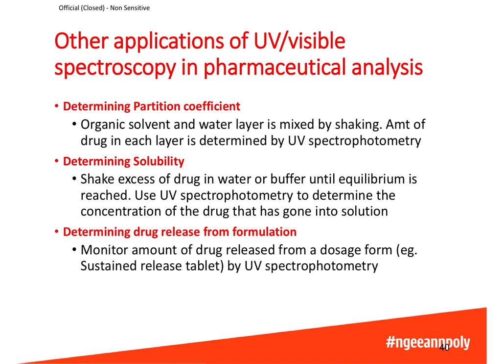One is determining partition coefficient. Partition coefficient is determined by shaking a mixture of a drug in organic solvent and water. The organic solvent that's used is octanol. Octanol and water are immiscible, so you will see a layer of octanol on top of a layer of water.